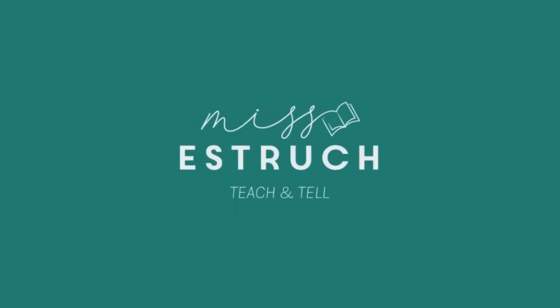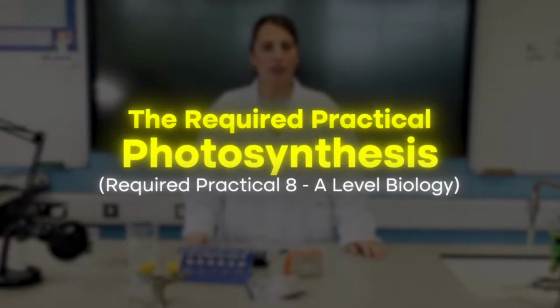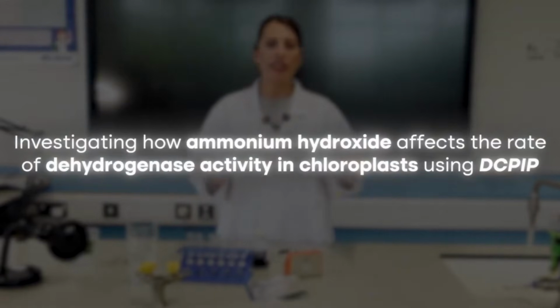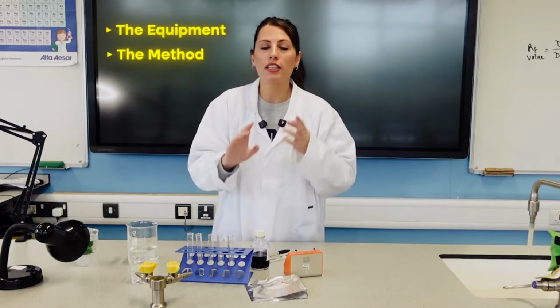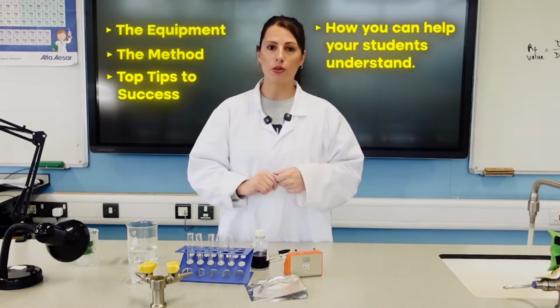In this video, I'm going to be going through the photosynthesis required practical for AQA A-Level Biology, the one with DC-PIP and looking at the enzyme dehydrogenase. We're going to be going through the equipment, the method, top tips for success, and how you can help your students understand what is going on in all of those test tubes.